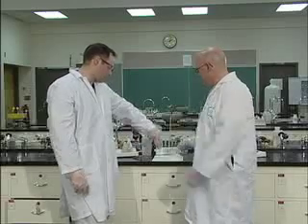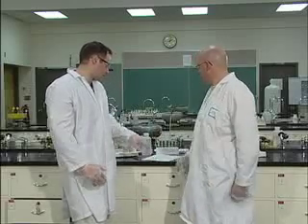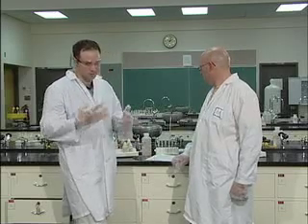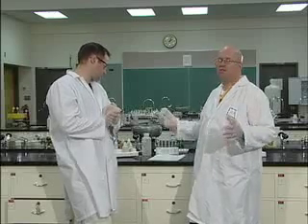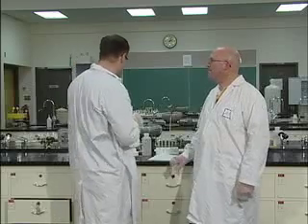Now the other thing we're going to do, next step. Make sure you record all those observations again. You're predicting products and reactants, so make sure you have a balanced equation for it. This one's a pretty simple balanced equation. You should be able to figure it out on your own, but if you don't know, ask. It seems like things are going by fairly quickly, so if you think you've messed one up, you can always do it again. There's lots of magnesium there. Plus, it's real fun, the magnesium.